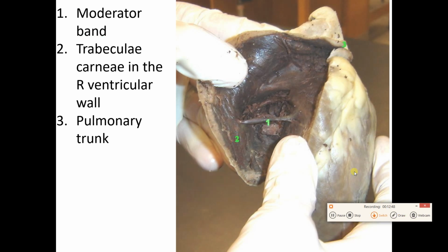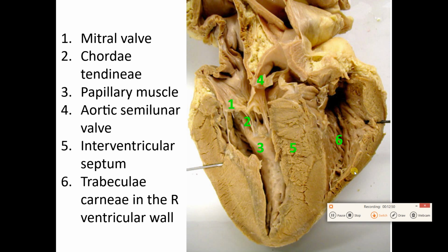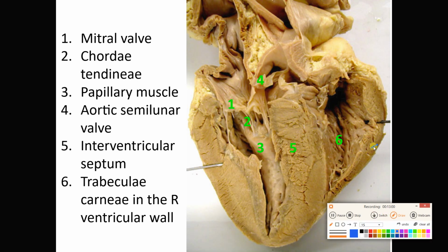All right. So now we've sliced open a heart so we can see both the left and the right side. Now, how can I tell the difference? Well, look at this wall right here and compare it to this giant, thick wall over here. So this must be my left ventricle. This is going to be my right ventricle.